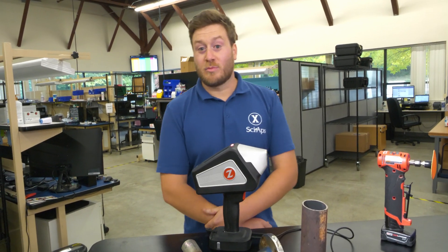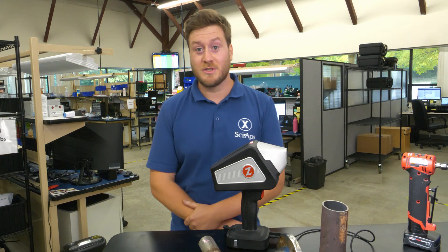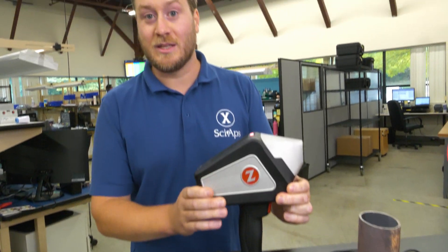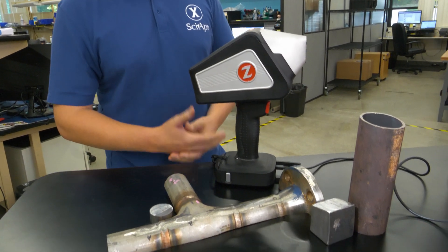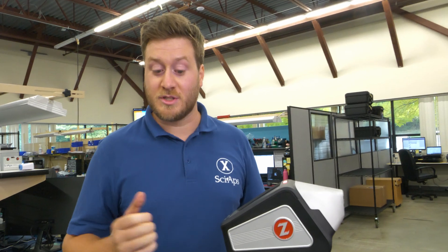Hi, my name is Colin Nygren. I'm a product specialist here at Syops and today I'm going to be showing you the Z200 C+. This is the world's leading handheld carbon analyzer utilizing LIBS technology. It's been widely accepted by all the major pipeline, refinery, steel mills, and also all of the inspection companies working within those different areas.